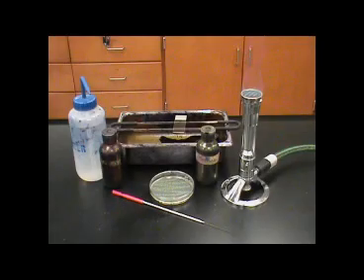This slide is another simple stain that was made with safranin. Safranin will stain the cells red. You will be using several different staining techniques throughout this course. All of them are based on the basic principles shown here in simple staining and properties of different stains such as methylene blue, crystal violet, safranin, or nigrosin. Staining is an important tool used by the microbiologist for the observation of bacteria using a microscope.